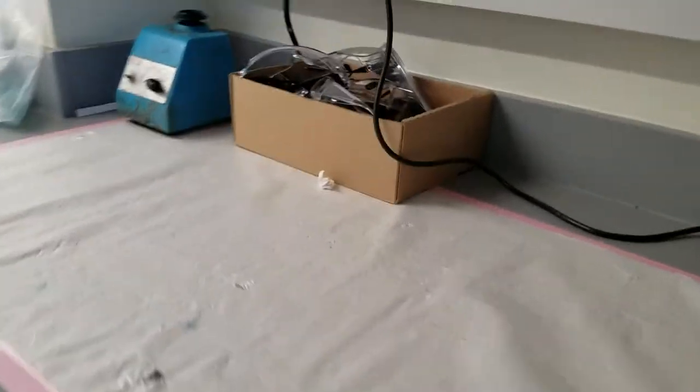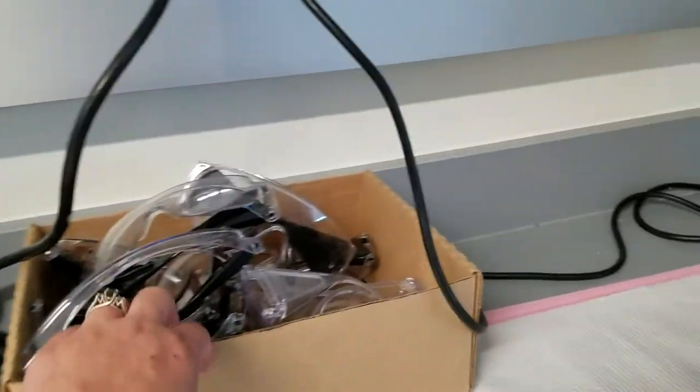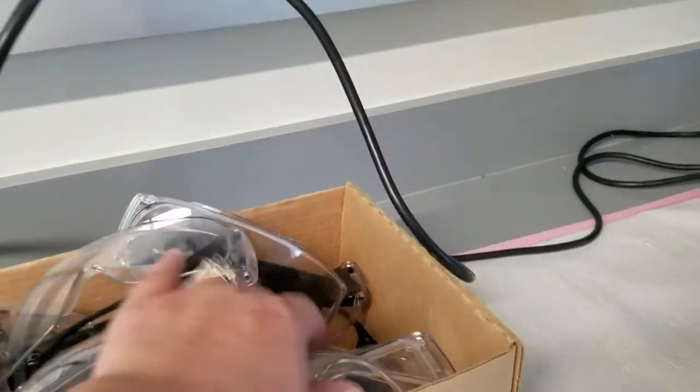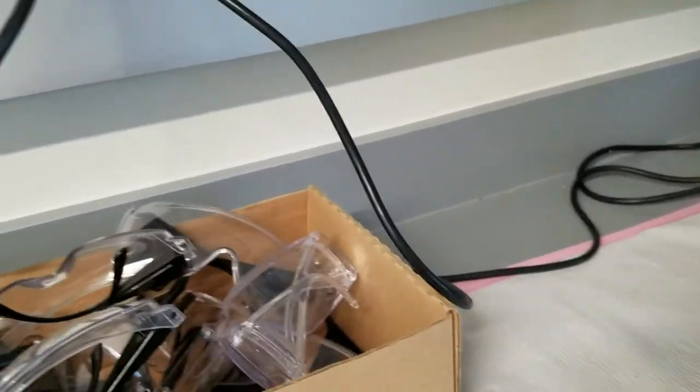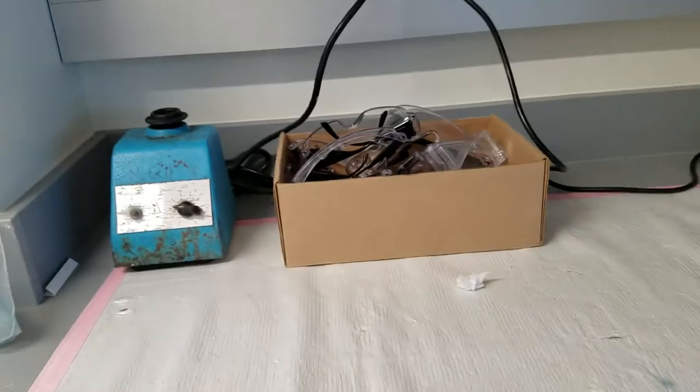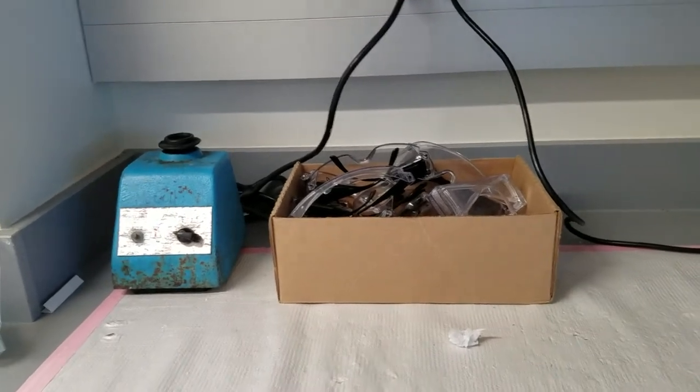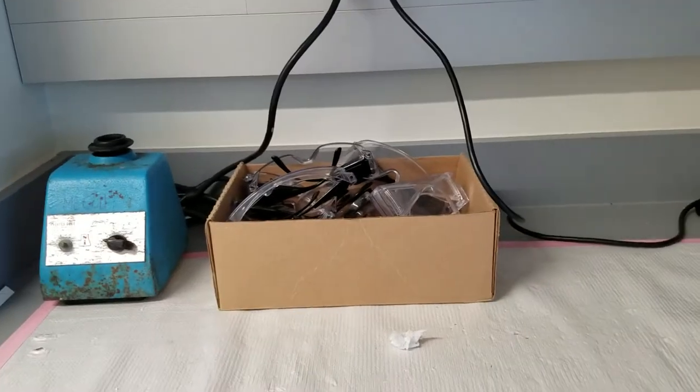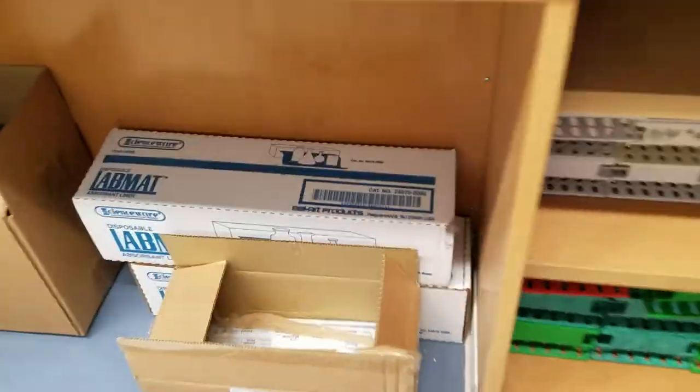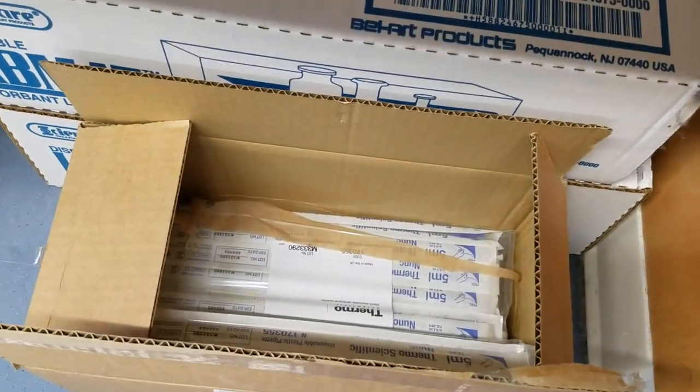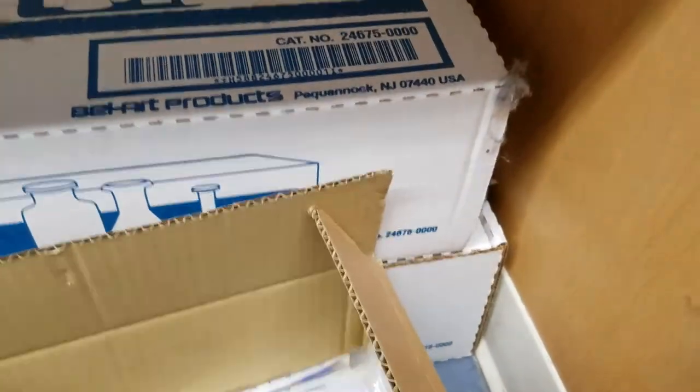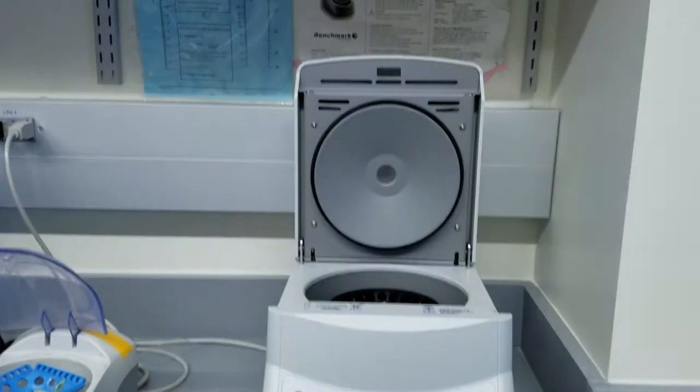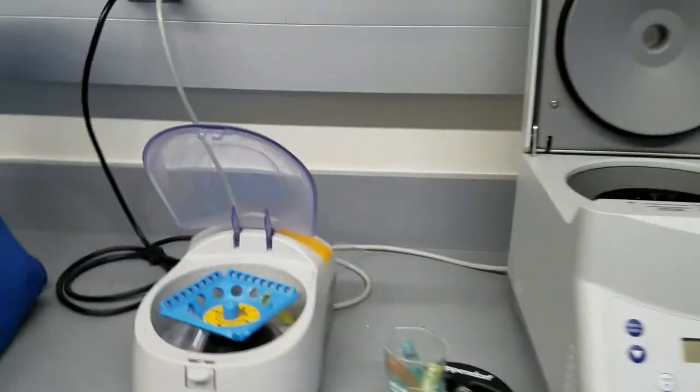We always provide safety glasses in our labs, but they are not enough for everyone, so you always want to have your own anyway. We always ask students to bring gloves to use as well. Here are some pipettes - the individually wrapped ones - so we use them once and then we dispose of them. Here is another centrifuge, a couple more of them for people to use on this side of the room, and then another vortex that they can use as well.